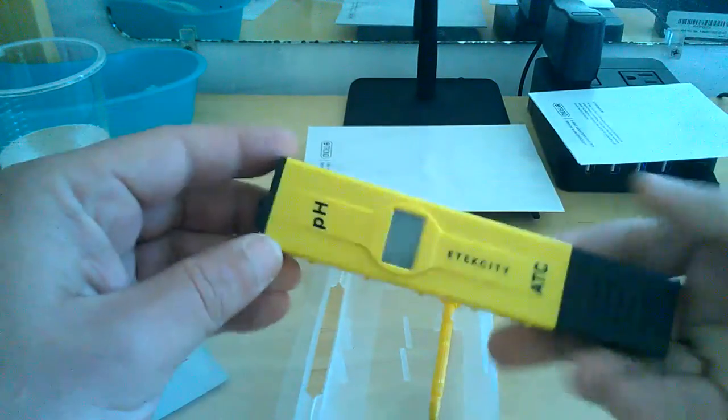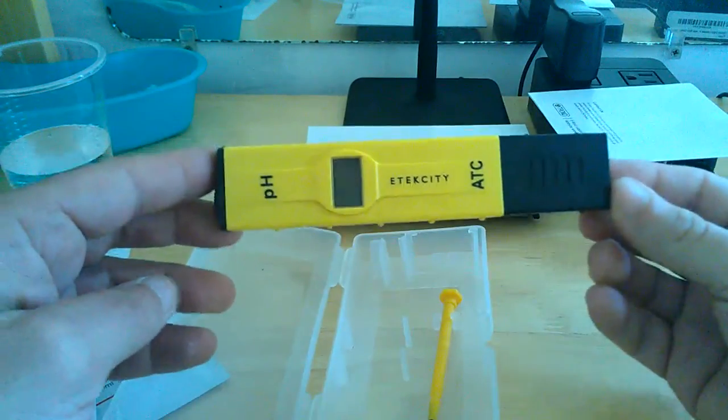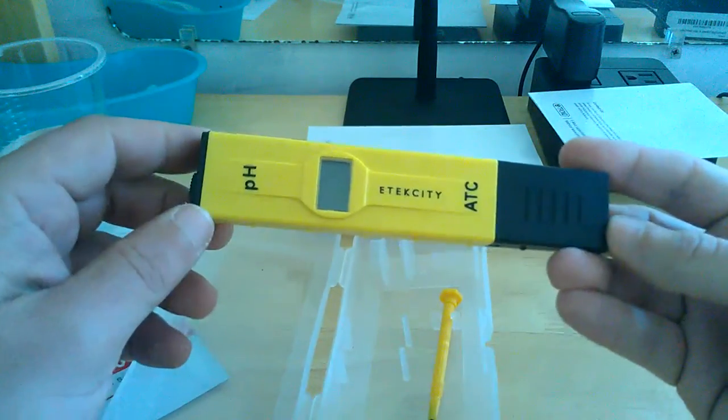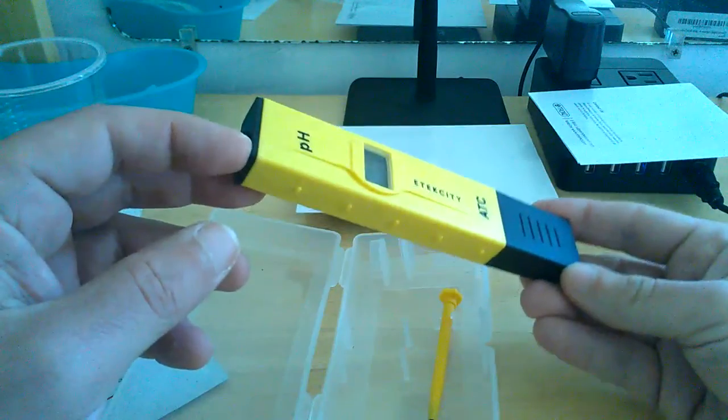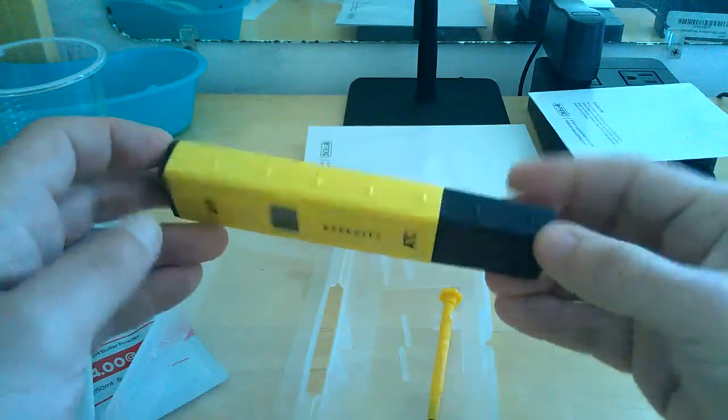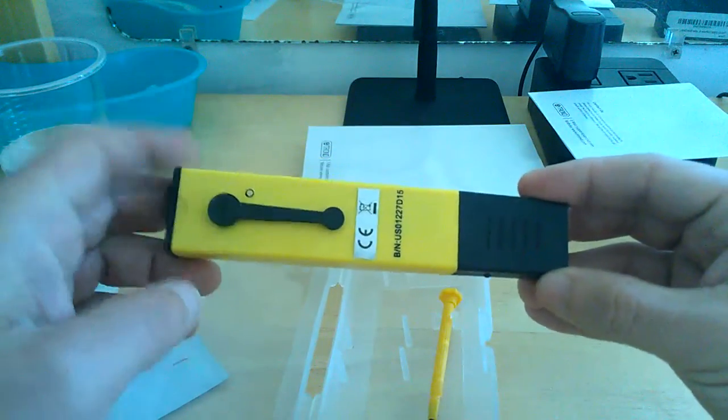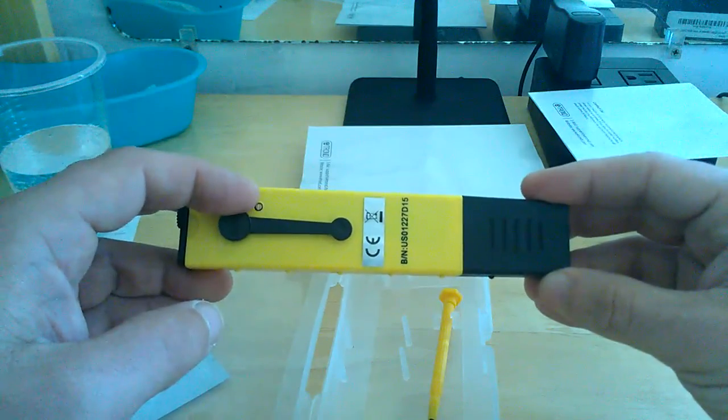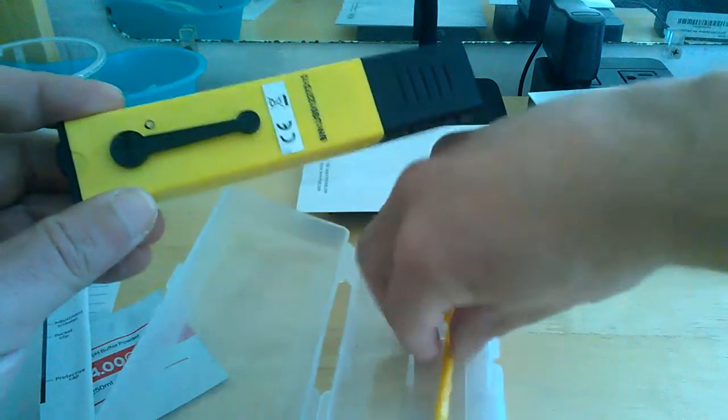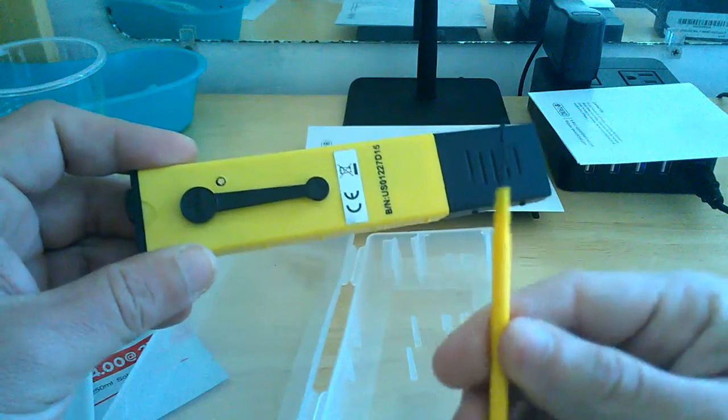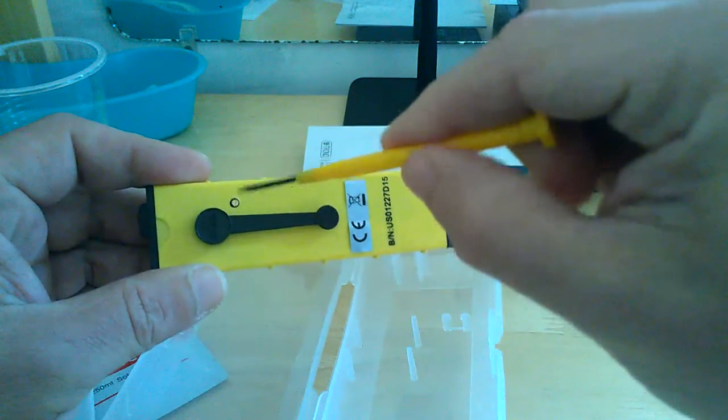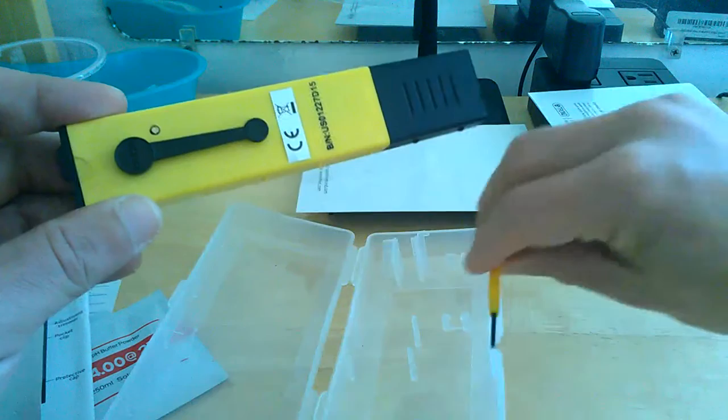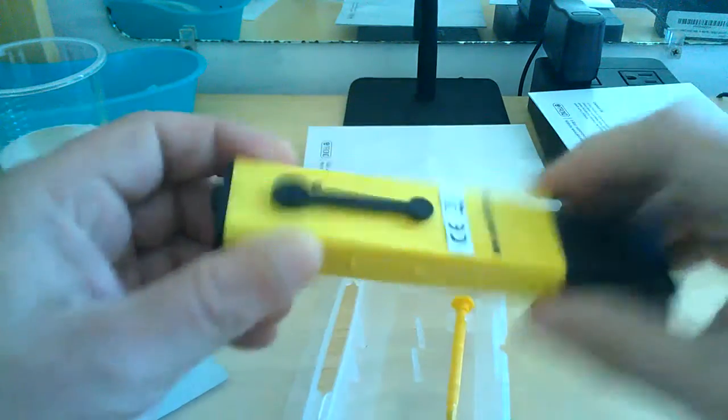As you can see, very compact. It's about 5 inches long. Nice digital backlit screen there. Your simple on off button at the top. Your protector for your cathode. Your belt clip or pant, whatever you're hooking it on. And your little adjustment screw there for when you calibrate it. And there is the provided screwdriver obviously for going in there and fine tuning it to get the exact measurement you guys need.